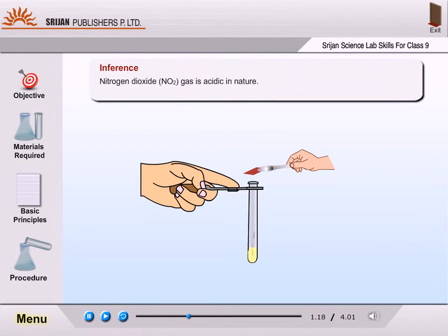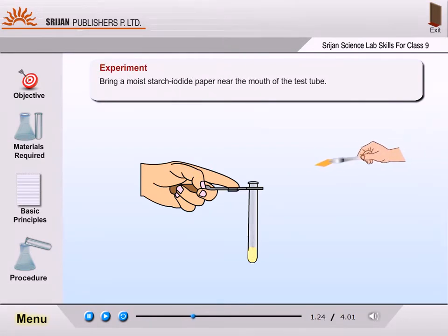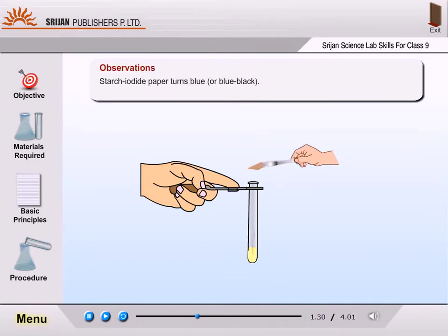Nitrogen dioxide gas is acidic in nature. Bring a moist starch iodide paper near the mouth of the test tube. Starch iodide paper turns blue or blue-black.